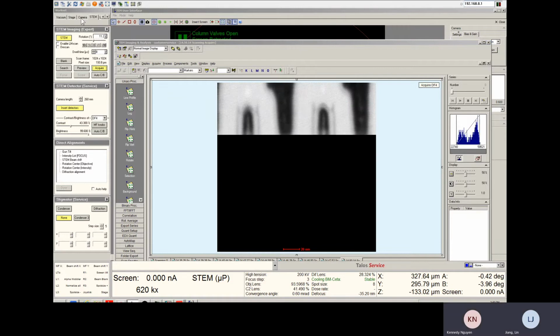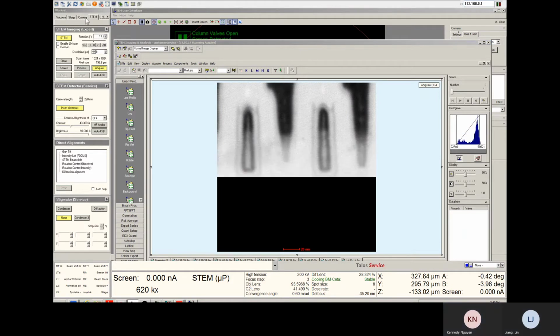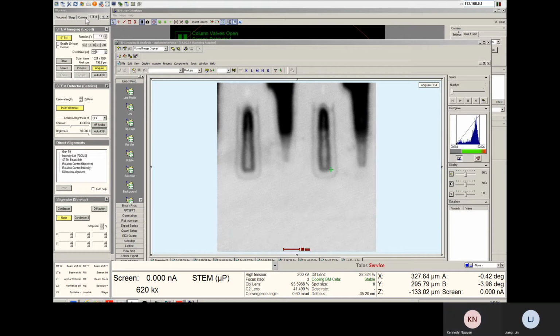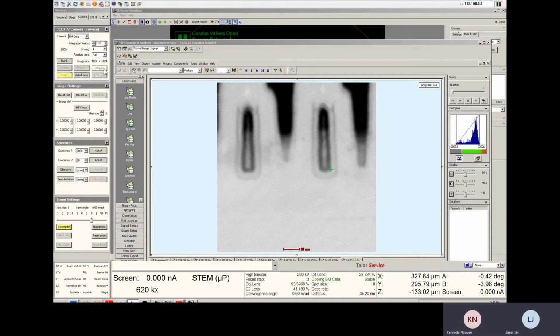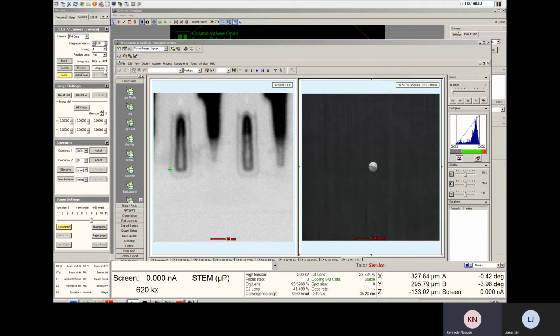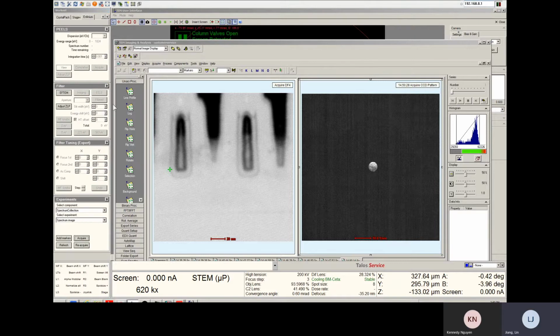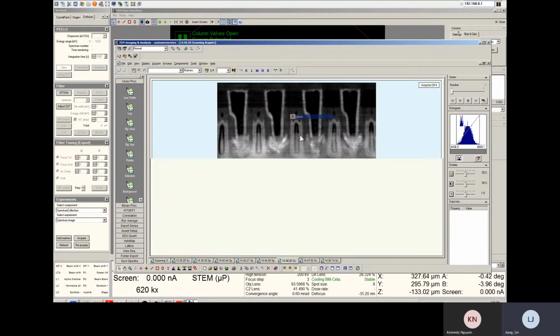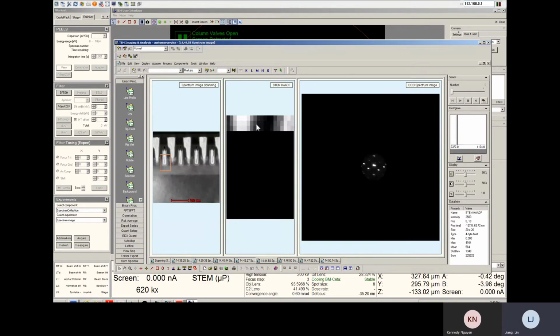And then, okay, so for the one that you had a picture of, when you did the experiment, how do you see the individual diffraction patterns based on the location? Okay, here's basically, I think here's the solution. So basically, let's go. Here, right? Yeah. So how do you? You can go. That's a good question.